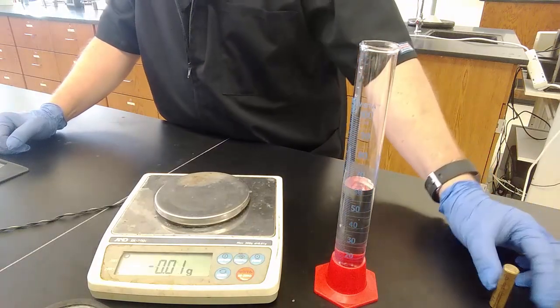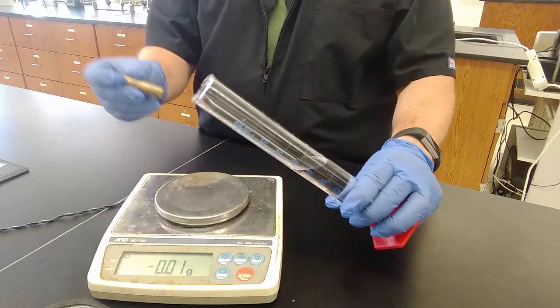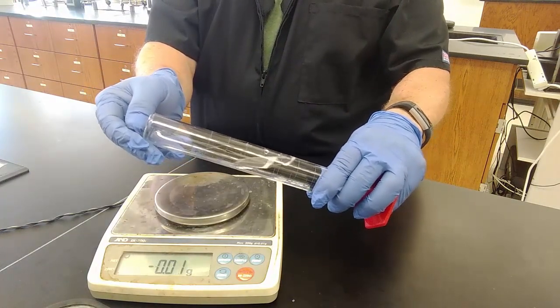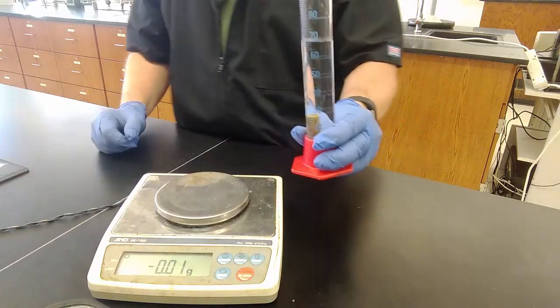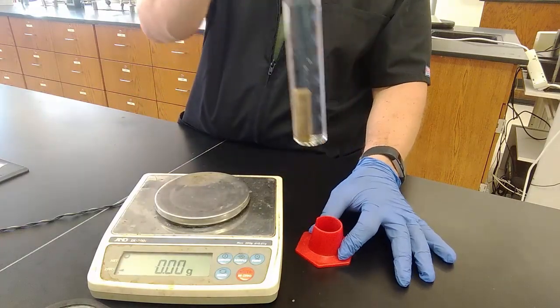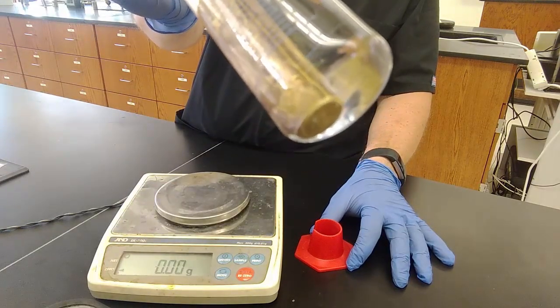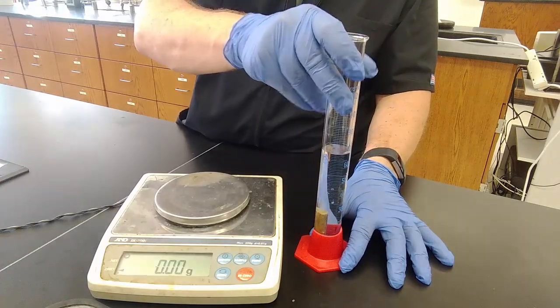Now, step 4. Hold the graduated cylinder at a 45-degree angle and slide that bar whose mass we made to the bottom. Okay? Now at this point I say stop. What's going to happen if I just drop that sucker in there? Well, if I take this out of the stand, you can see that the bottom of this graduated cylinder is glass. So I leave it to you to figure out what would happen if I just drop this puppy in there.